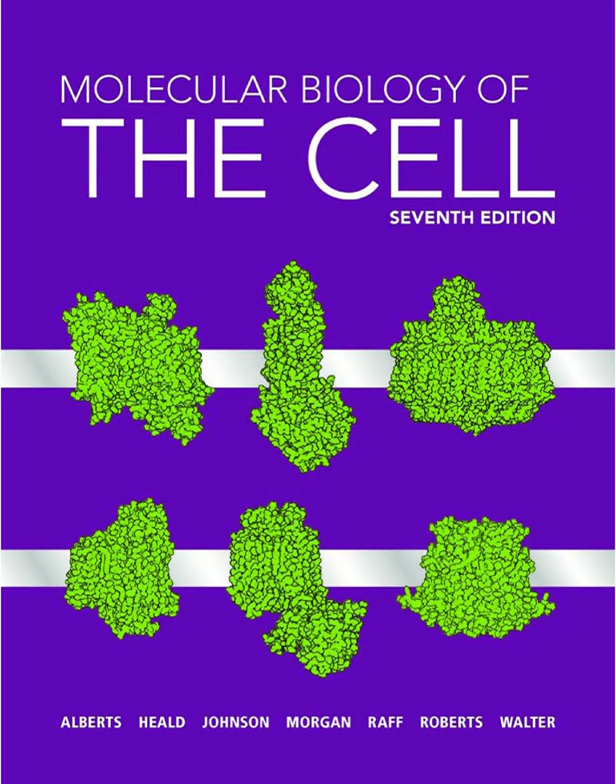You can see the detailed shapes of organelles, macromolecular assemblies, viruses, and newer electron sources, like field emission guns, push that resolution even further for some applications. So what's the basic setup? A transmission electron microscope, TEM.